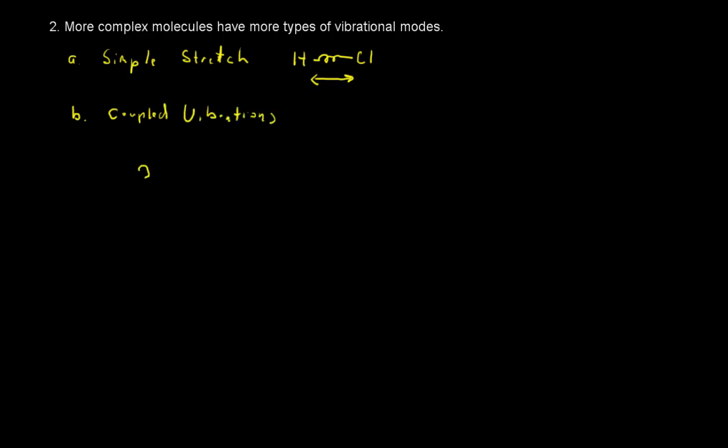One type of coupled vibration is known as a symmetric stretch. In a symmetric stretch, both atoms are moving with the same frequency in the same direction.